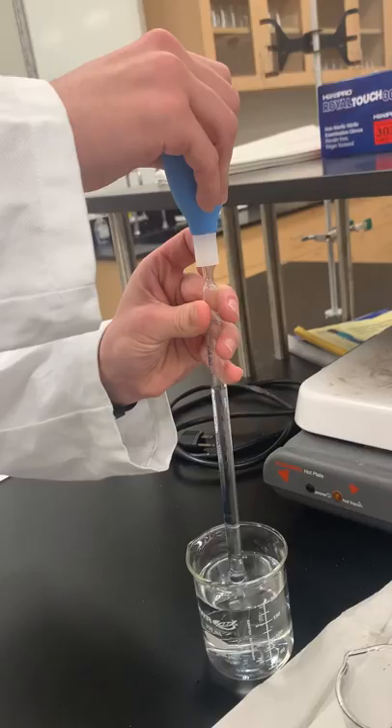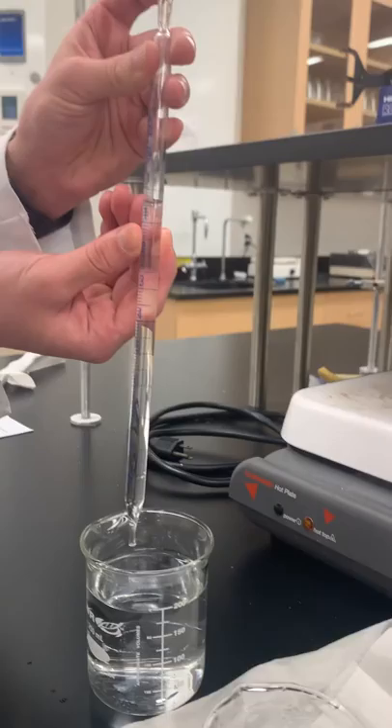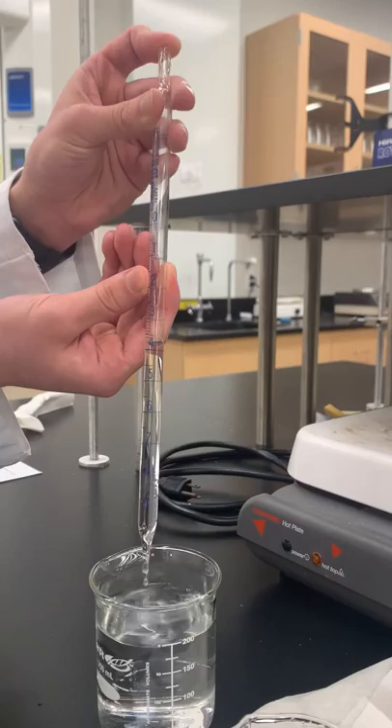So I want to get five milliliters, so I drew it up past five, and I quickly replaced the bulb with my finger so the solution wouldn't go down. And now, using my finger, I can slowly dispense solution until the meniscus is where I want it to be, right at five.